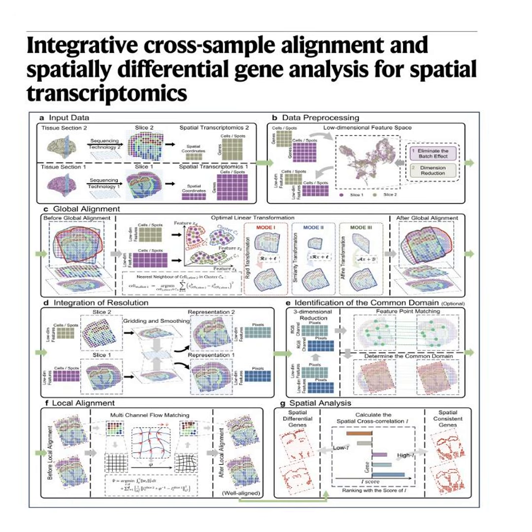But wait, I have a logistical pushback here. What if the two slices don't even cover the same area to begin with? Let's go back to our city map analogy. What if slice A captured just the downtown area and slice B captured the entire county? That happens a lot, actually. Right, you can't just stretch downtown until it fits over the whole county. The biology wouldn't match at all. This is exactly why many older spatial algorithms fail or require scientists to manually crop the images beforehand.